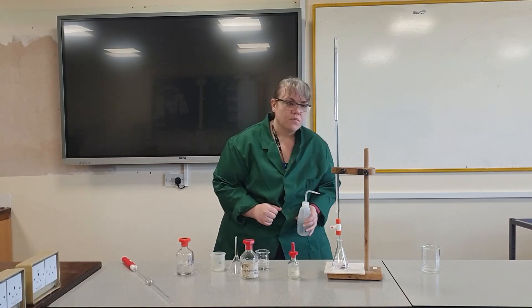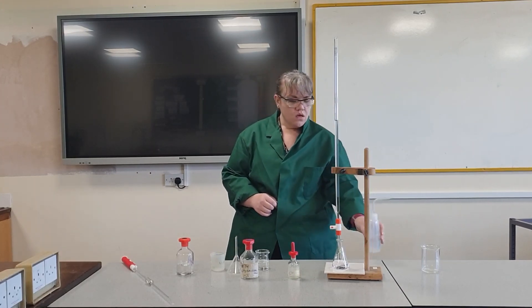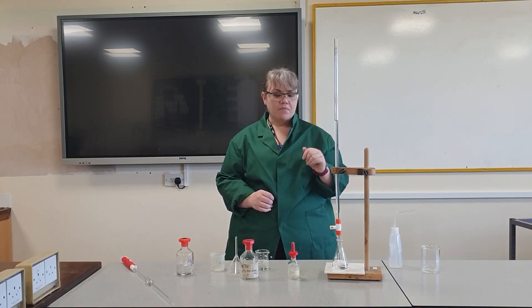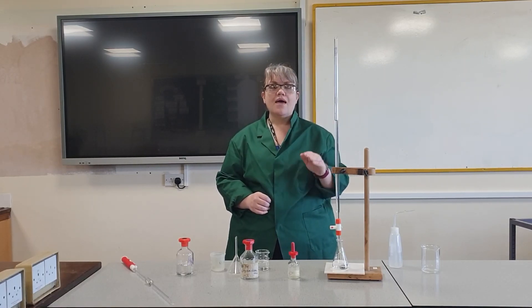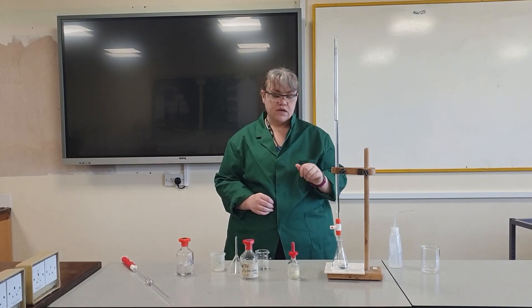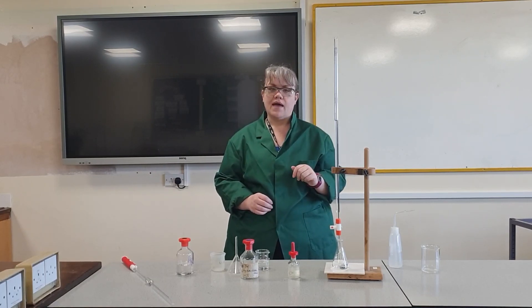So my volume is 22.5 centimetres cubed. I will repeat that three times and then take an average to get my mean volume for the titration for these two solutions. I can then use that to calculate the concentration of my unknown — in this case my acid.